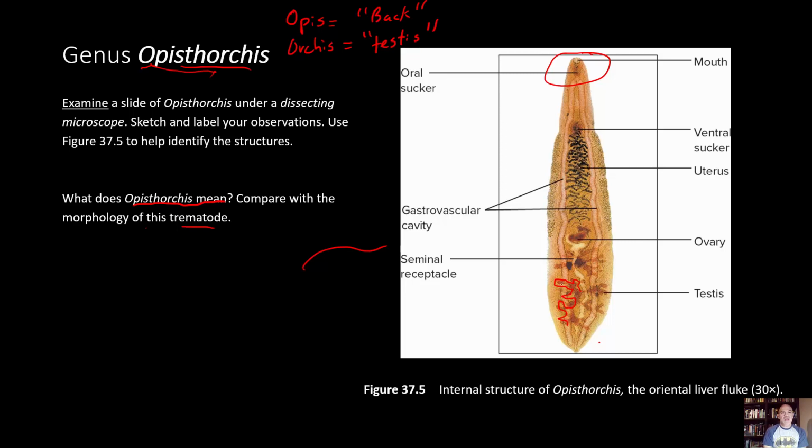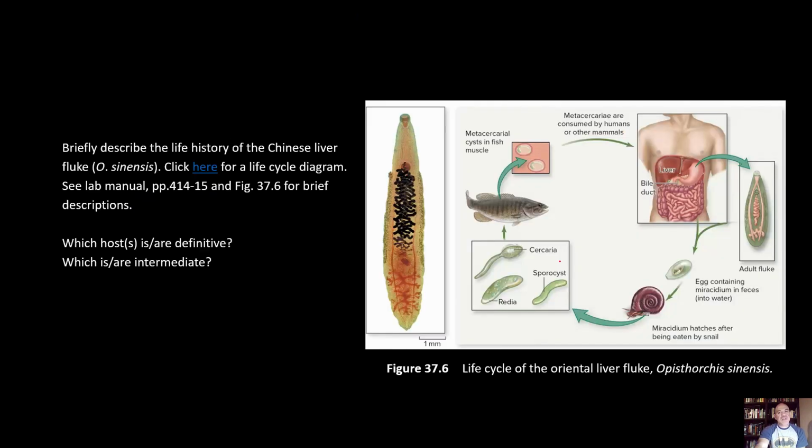are produced. So this Opisthorchis, also called Clonorchis, I mentioned that earlier. And this is what it would look like under the microscope. So again, make some sketches and learn the name and associate it with this image, in case I ask you what is the genus.